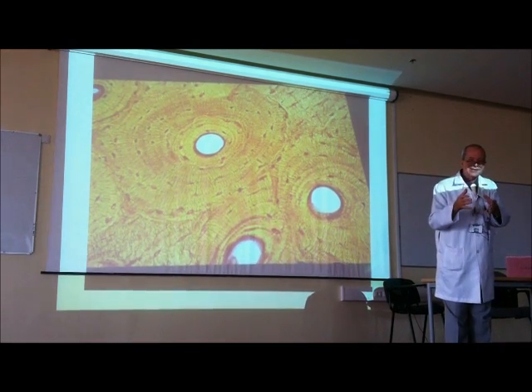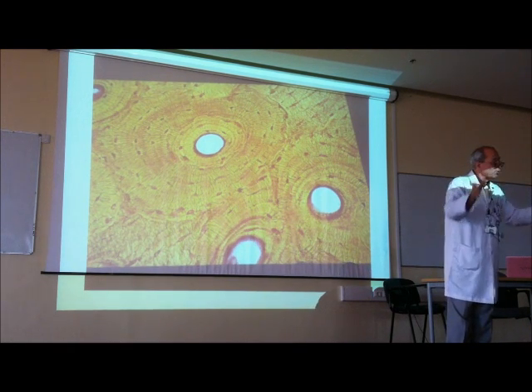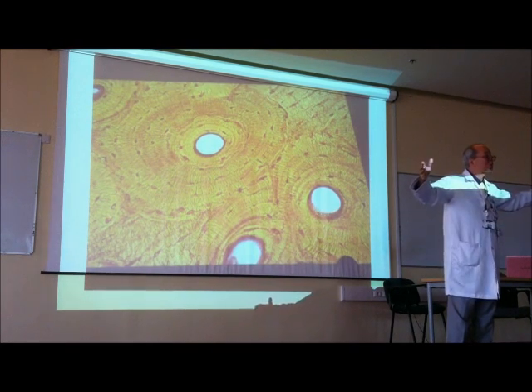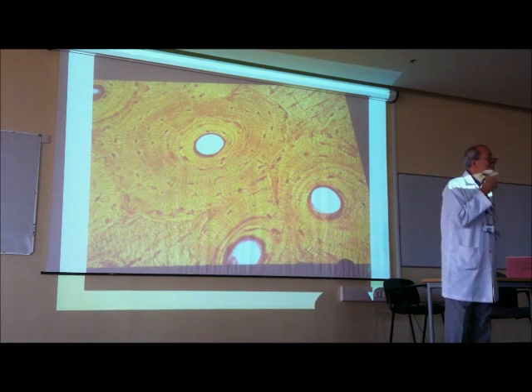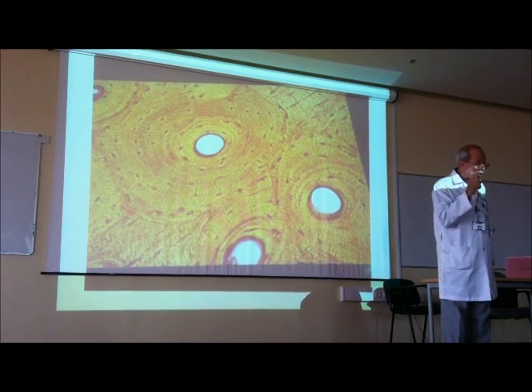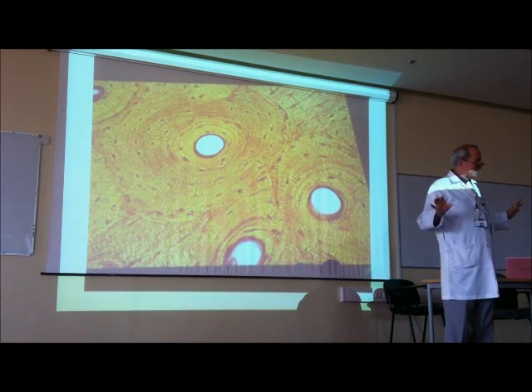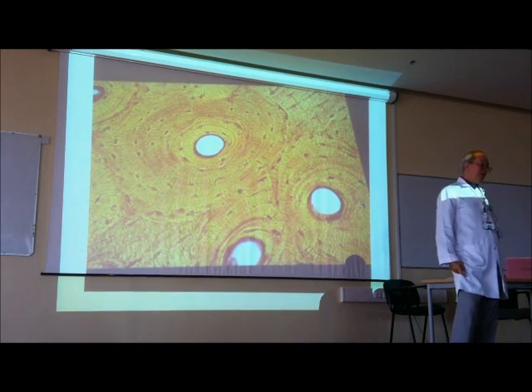So, if there is need for destruction of bone at this site, the blood monocytes come together and fuse to form the osteoclast. So, osteoclasts are present at the surface at sites of bone destruction. But osteogenic cells and osteoblasts are present in the endosteum. Okay?